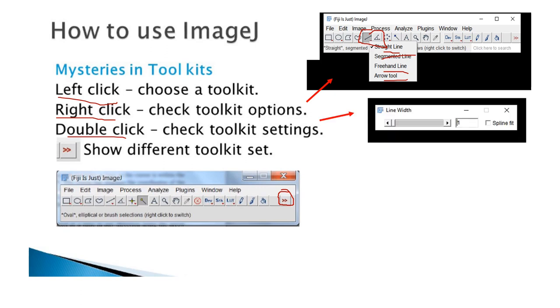If you press double click on the line tool, for example, it will show you how thick the line will be. You can change the number or move it to the right to make the thickness different. When you press left click, right click, or double click, they will give you even more options. There are so many menus and so many things to do.